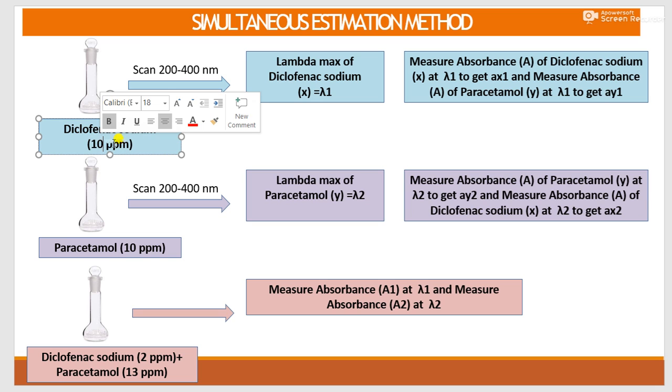Now we have three solutions with us: a 10 ppm diclofenac sodium standard solution, a standard paracetamol solution of 10 ppm, and a sample solution containing 2 ppm of diclofenac sodium and 13 ppm of paracetamol.